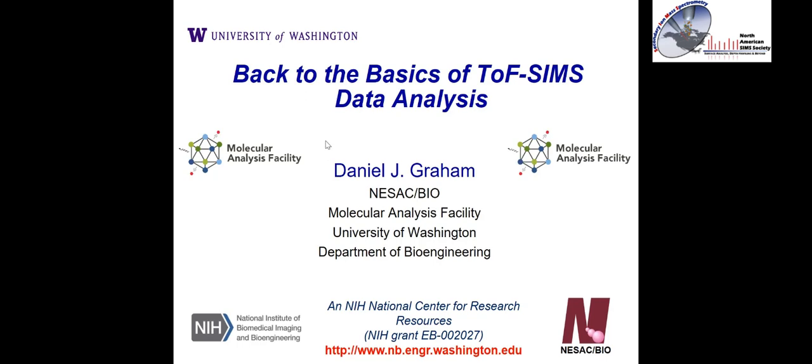Today, I want to talk about SIMS data analysis. I really want to go back to some of the basics, things that I wish I had known when I first started SIMS. I'm not going to go into details about multivariate analysis today. I'm just going to stick to some of the fundamentals.